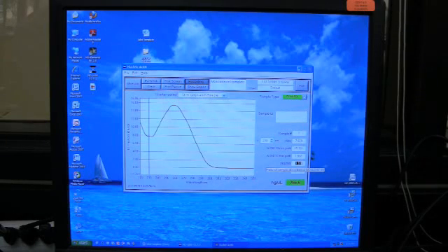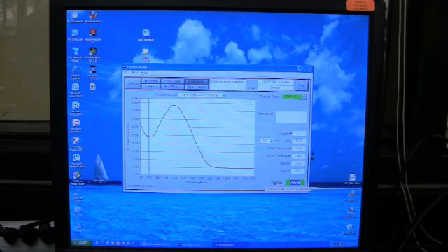For DNA, this ratio should lie close to 1.8, with deviations no greater than one tenth. The quantity of the sample can be found in the lower right corner as well, highlighted in green. The concentration is measured and displayed in units of nanograms per microliter.